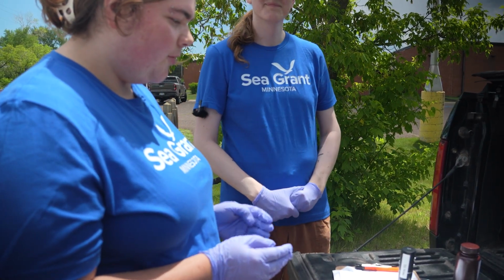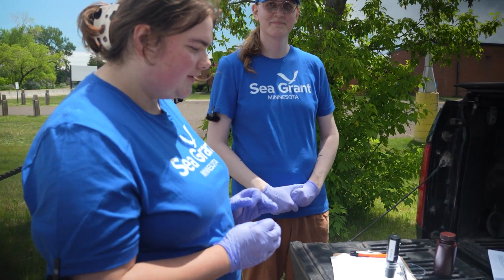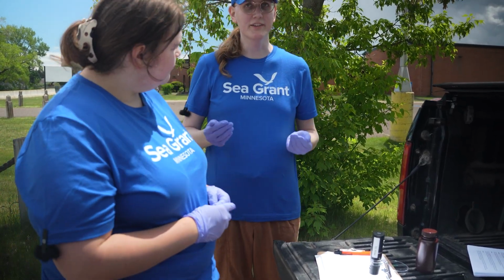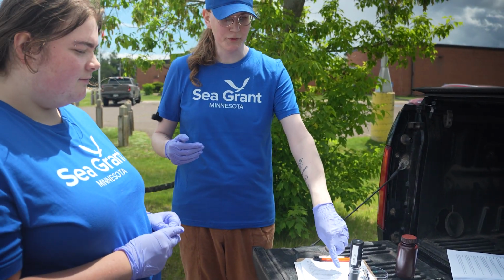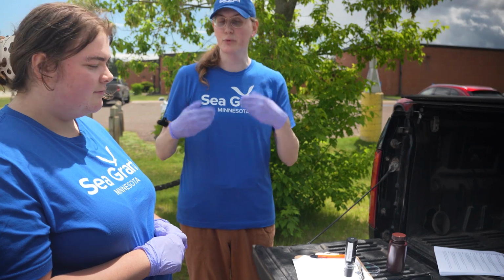Now you can open your mobile device's Wi-Fi and connect to the network of the microscope. It'll be called mnsg, and then a few letters and numbers. And once you've connected to the Wi-Fi, your app will show a display of the microscope's viewpoint, and you'll be able to take images or even record video.